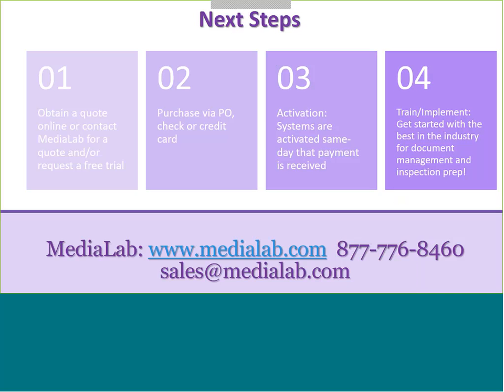As far as next steps, I just wanted to outline what you can do after you enjoyed what you see today. The first step is maybe to obtain a quote from us. You can also ask for a free trial. We do free trials all the time. You'll get 30 days to play around in the software, add some users, test out the features, and make sure that it's a great fit for you.